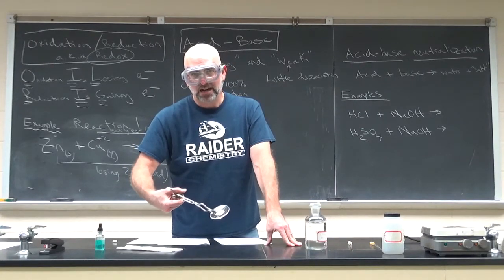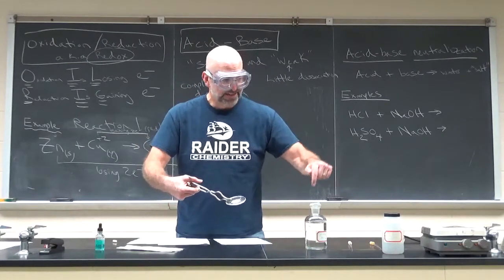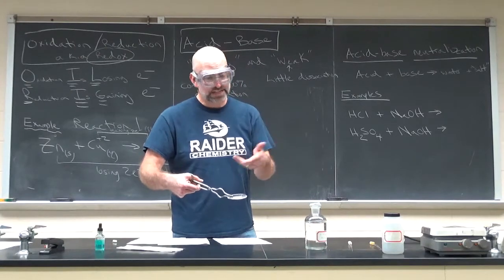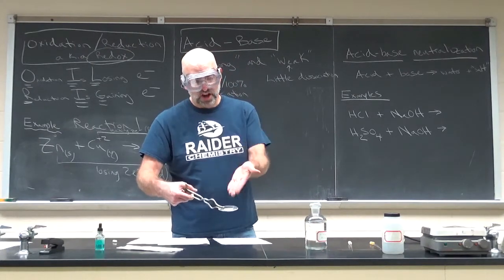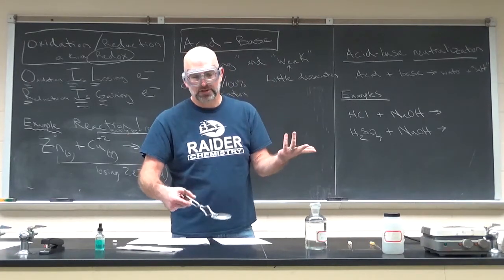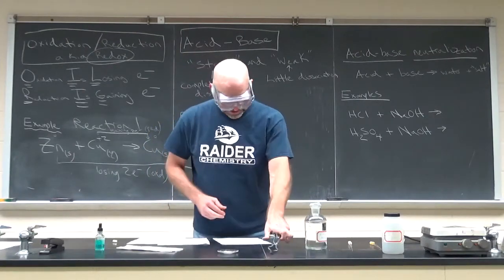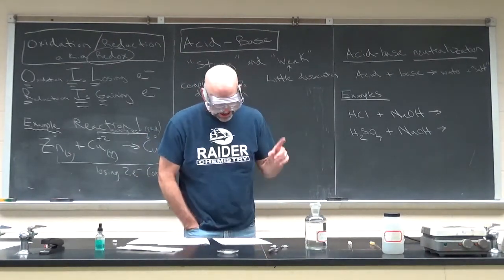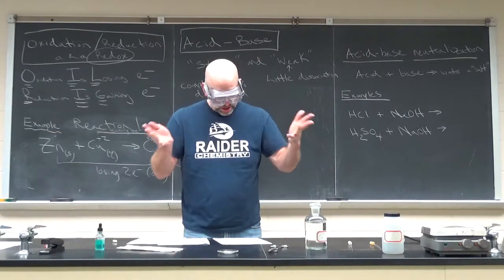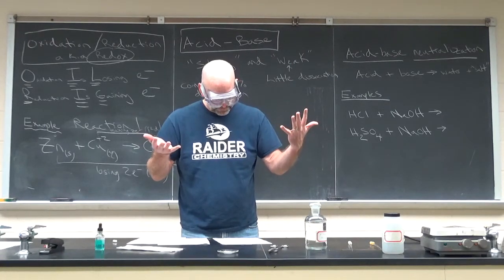I added HCl and NaOH, acid-base neutralization. It produces water, which is now gone, and then a salt that's left over. And salt is in quotes. It's really an ionic compound. Well, maybe now I'm insulting your intelligence, but let's at least talk about it a little bit. Actually, procedure number 1 for acid base and procedure number 4 are very similar.